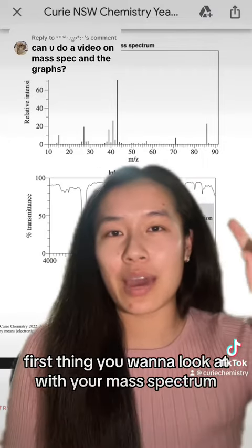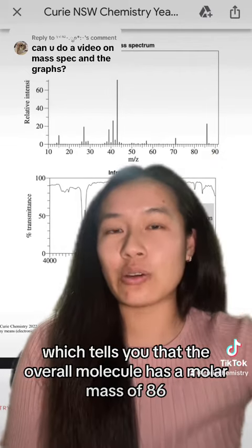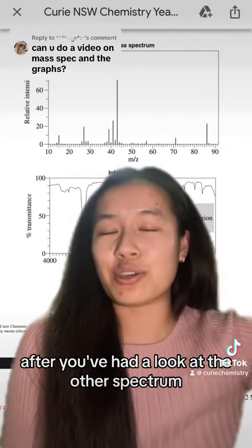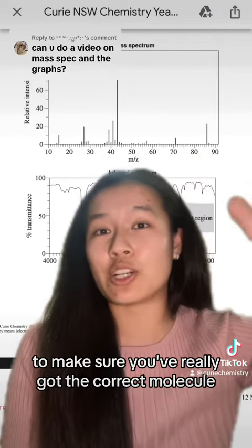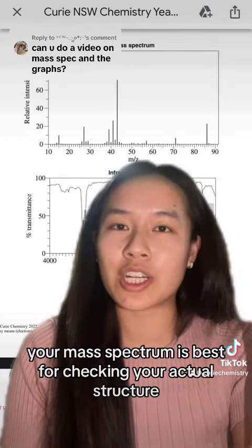First thing you want to look at with your mass spectrum is actually this molecular ion peak at the right here. So that's a peak at 86, which tells you that the overall molecule has a molar mass of 86. So that's actually something that you'll check at the very end after you've had a look at the other spectra. So mass spectrum is something you'll come back to at the end to make sure you've really got the correct molecule.